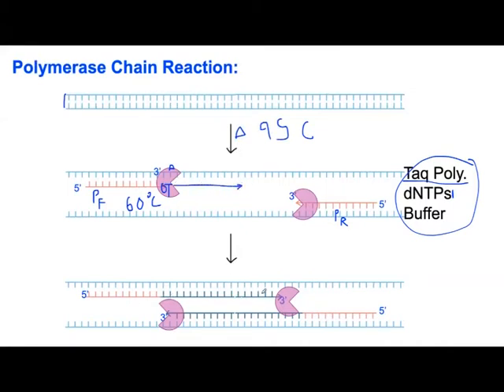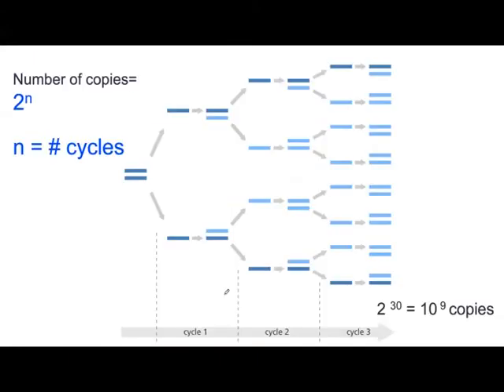And then that's the upper strand, it's synthesized, and the lower strand is synthesized. So the end product you get from the polymerase chain reaction, this area of the DNA, now after one cycle of PCR, like heating, annealing, and synthesis, you're going to get 2 copies. That's why after 1 cycle, 1 molecule of DNA, you're going to get 2 molecules of DNA if the efficiency is good. And usually in PCR, we do more than 1 cycle.